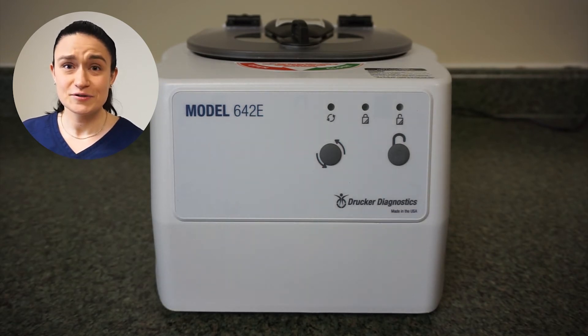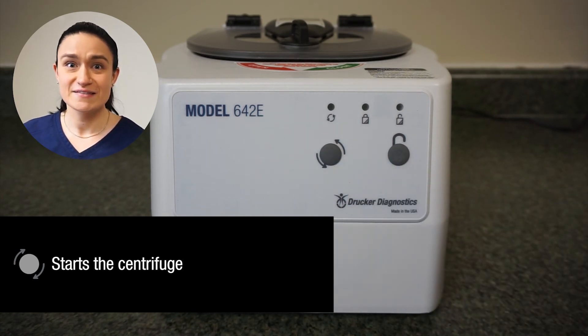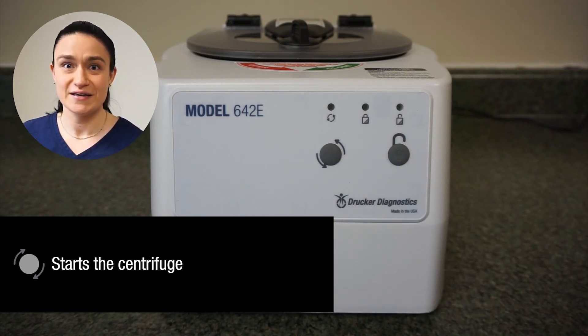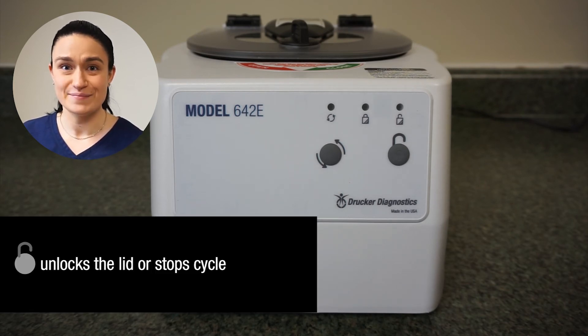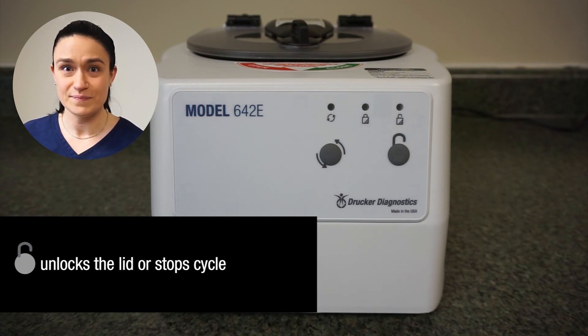There are two buttons that control your 642e. The left button is the start button — this starts your centrifuge running for its pre-programmed speed and time. The right-hand button is stop unlock. This button will stop any currently spinning cycle. If the centrifuge is not in motion, it will cause the centrifuge to become unlocked, meaning that you can open that latch and access your samples.